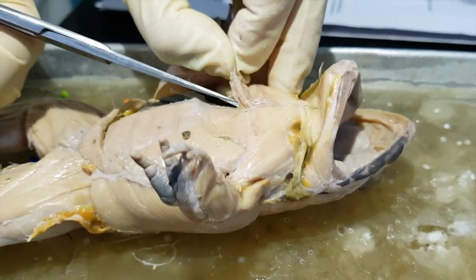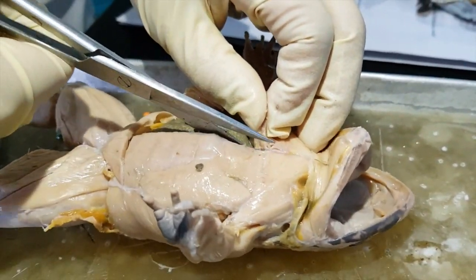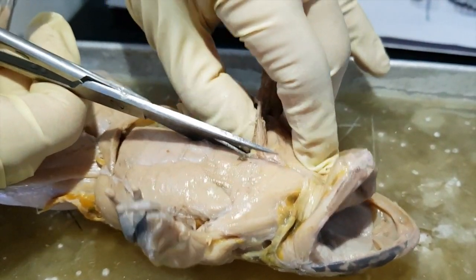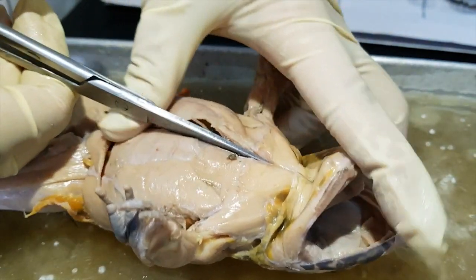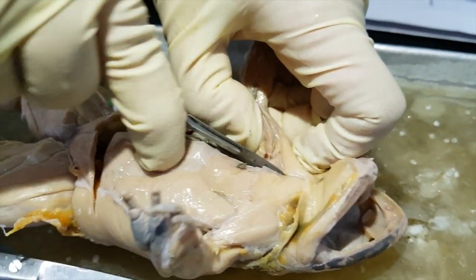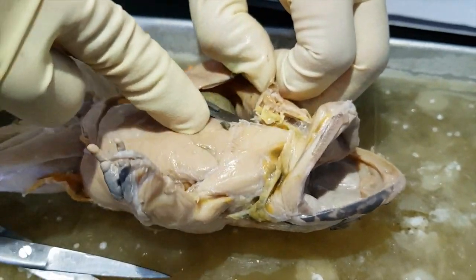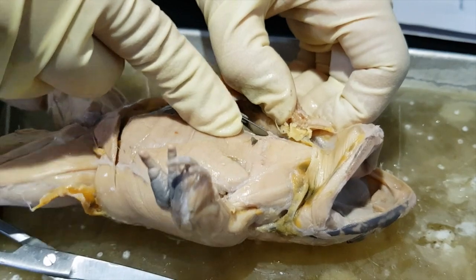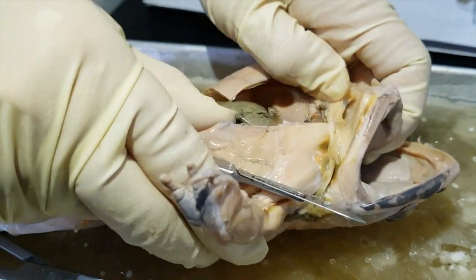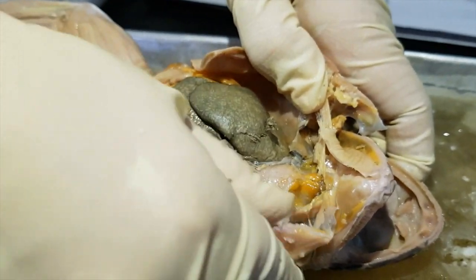Grabe na livers na. Kaya siya malaking palawa. Ay, kami na lang magsalita. Naka-record pa.